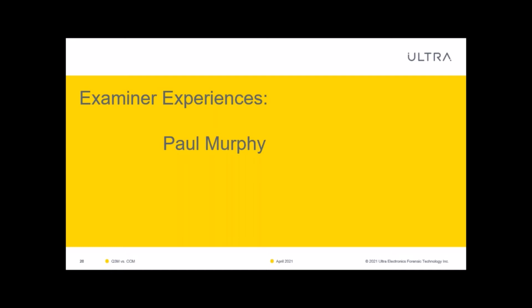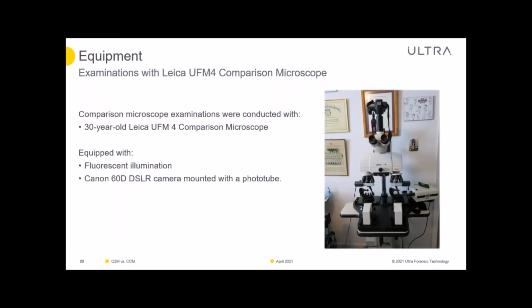I'm just going to share my experiences with this trial. The equipment that I used was an old, about a 30-year-old Leica UFM4 comparison microscope equipped with fluorescent illumination and a Canon 60D DSLR camera mounted on a photo tube.